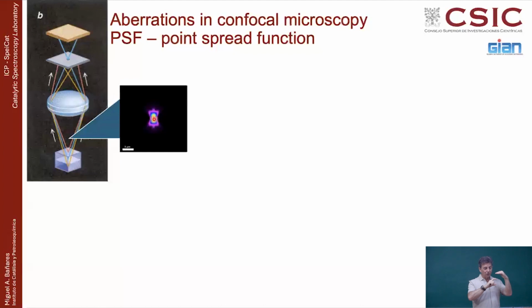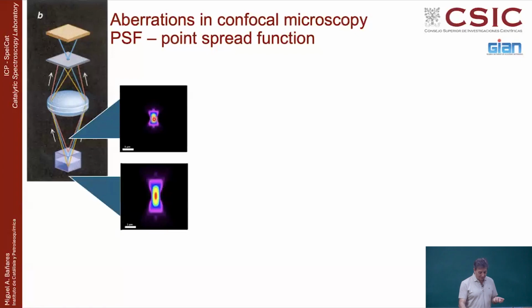And also because you have all this kind of spreading of light, the collection is also not that efficient. So the deeper you go into it, the more inaccurate, the more distorted you are, and the less efficiently the signal goes back to you. So what do we do? The deeper I go, the more spread it is and the worse the signal comes back to me.